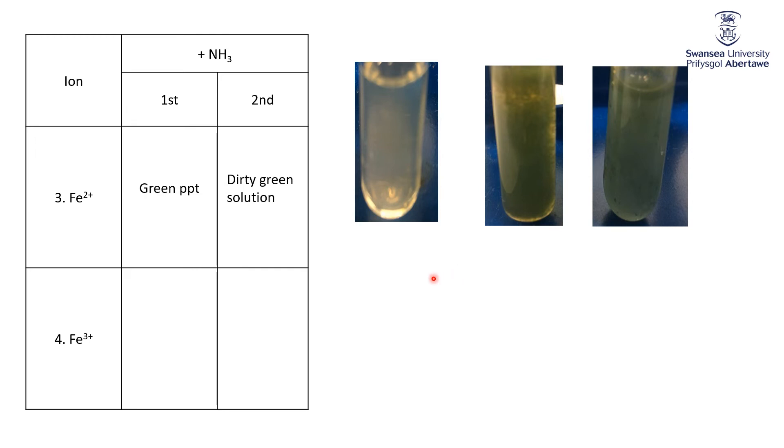Now, something that's important about Fe2 plus is it very easily is oxidized to Fe3 plus. So you might remember at the start of the whole thing, I said that the first few groups didn't get to see truly Fe2 plus, because unfortunately the solution had immediately, well not immediately, but by the time it was there for you, oxidized into the Fe3 plus. And just to show you how quickly that happens, here was the solution, that dirty green solution of Fe2 plus with some ammonias and waters around it. Ten minutes later, this is what it looked like. You see how it's oxidizing to that deep red solution that is indicative of Fe3 plus. So Fe2 plus very easily oxidized to Fe3 plus.